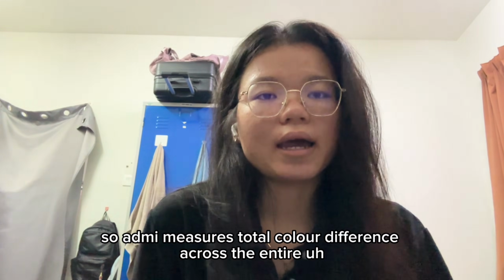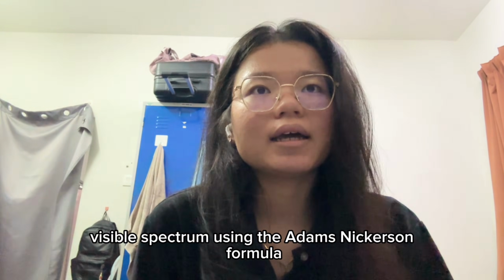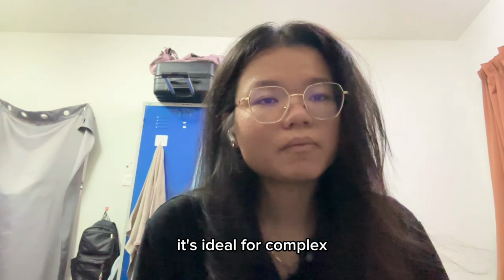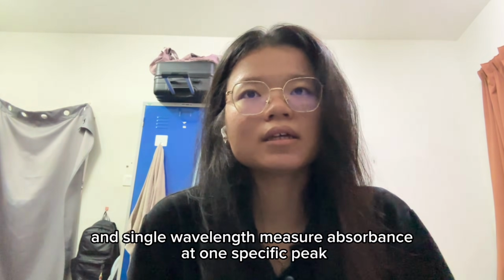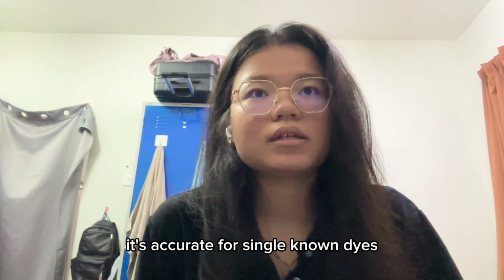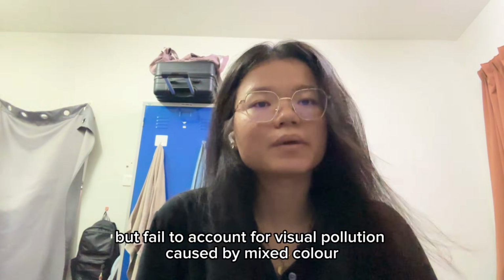So ADMI measures total color difference across the entire visible spectrum using the Adams-Nickerson formula. It's ideal for complex, mixed industrial effluents where specific dyes are unknown. And single wavelength measures absorbance at one specific peak. It's accurate for single known dyes but fails to account for visual pollution caused by mixed color.